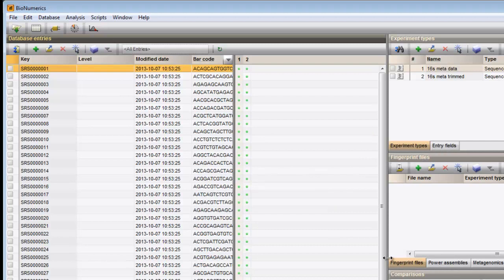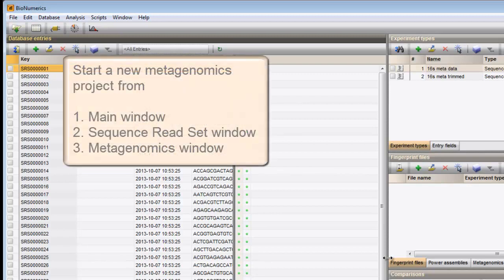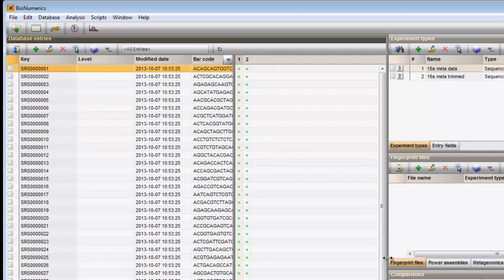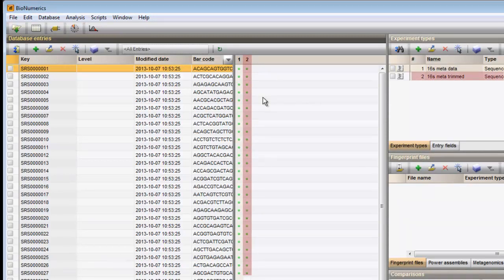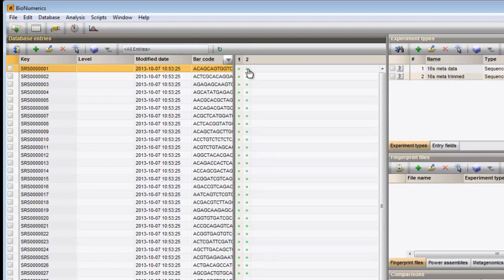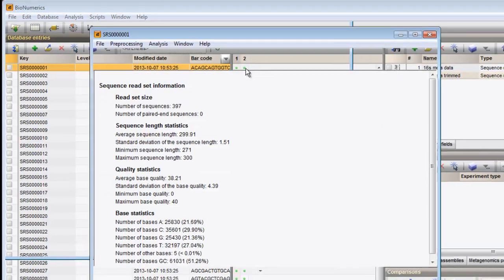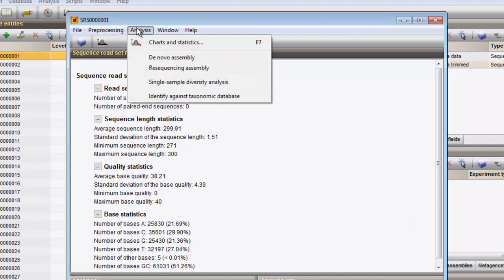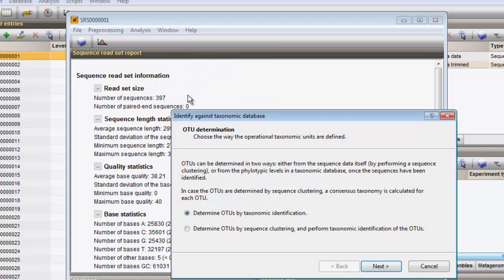With the reference alignment and taxonomy database imported, we can start the identification analysis. A new metagenomics project can be initiated from the main window, the sequence read set experiment window, as well as from the metagenomics window. In this example, we will start the analysis from the sequence read set experiment window. I click the colored dot of the trimmed sequence read set experiment type to access the data. Under analysis, I select identify against taxonomic database to initiate the wizard.